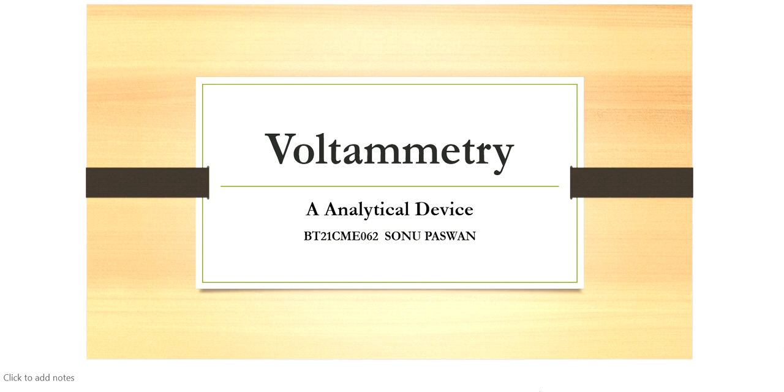Voltammetry. This is a device which is used in various fields including analytical chemistry, material science, and electrochemistry to characterize and analyze properties including verifying its electrochemical reversibility, determining the number of electrons transferred during its oxidation or reduction, and determining the equilibrium constant in the coupled reaction. I will start with a brief description of these topics. Later on, I'll cover the whole details one by one.